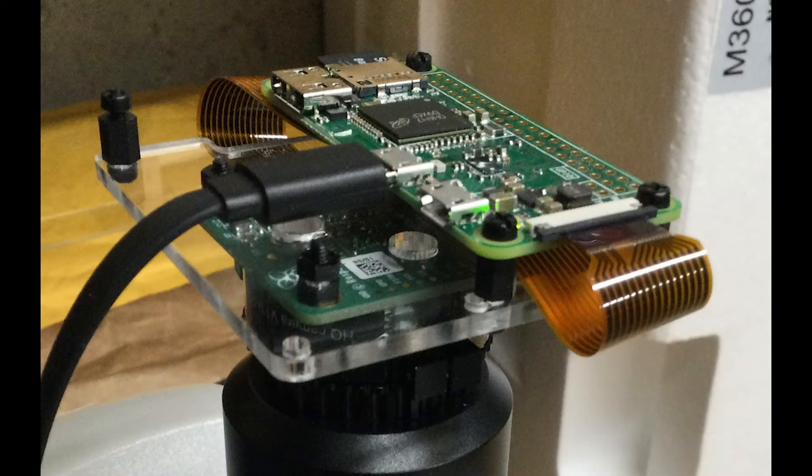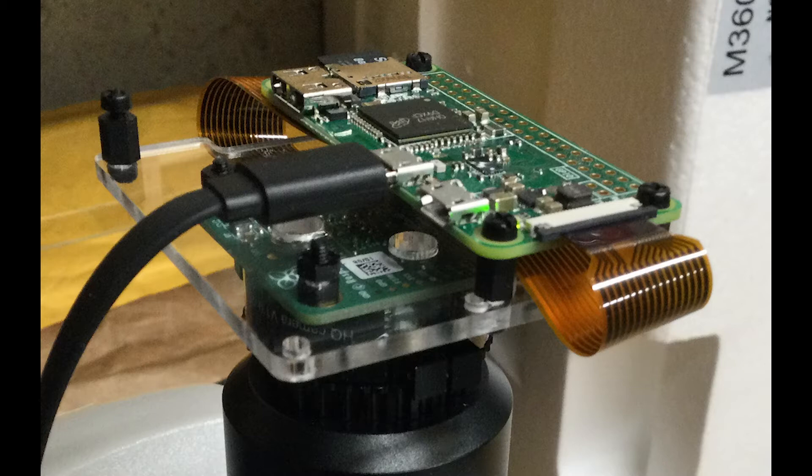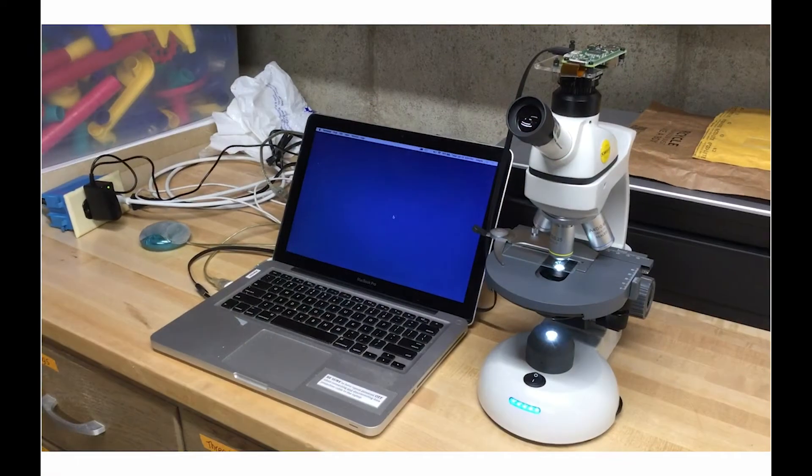In this setup, a Pi Hut camera attachment plate is being used. A different setup that uses a hard Pi Zero case is planned to replace this setup.